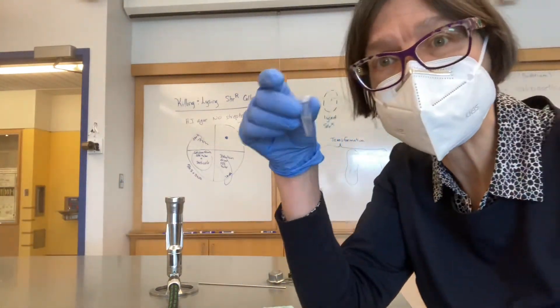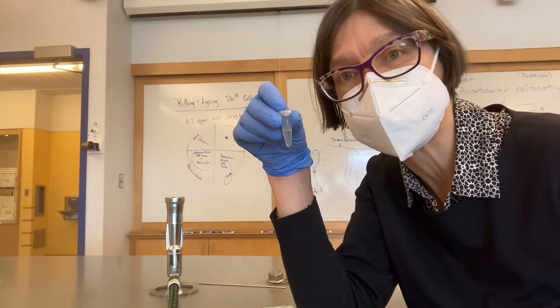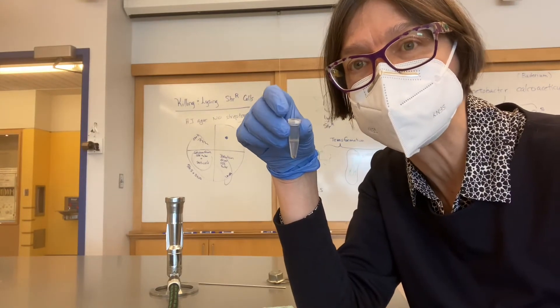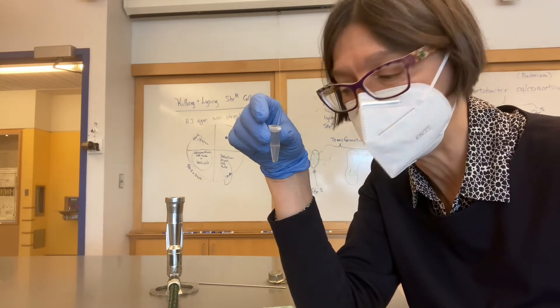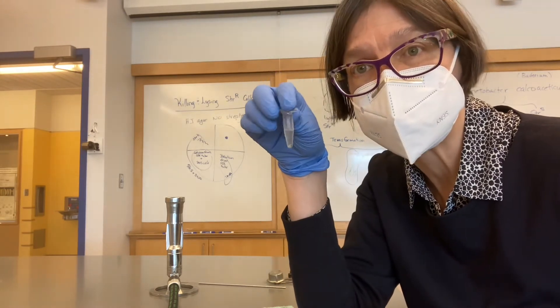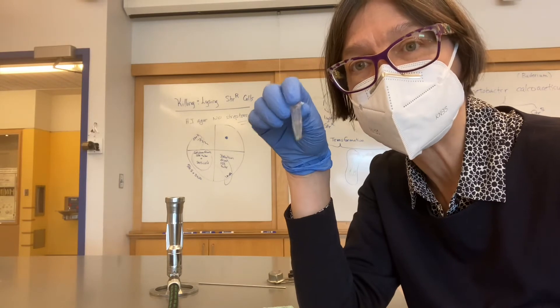And then I'm going to take this tube, which contains strep-resistant Acinetobacter calcoaceticus. Included in the genome is the AAD2 gene, and it's in a solution of SDS, which is a harsh detergent.